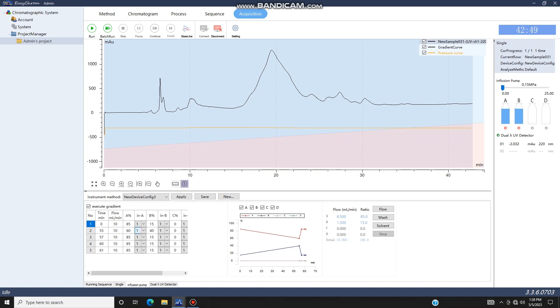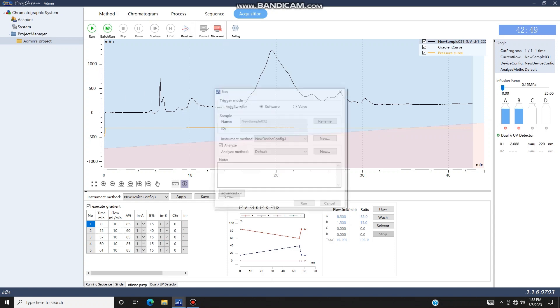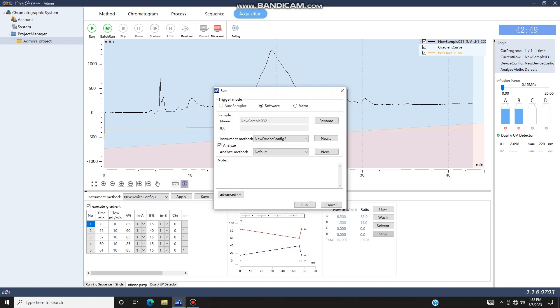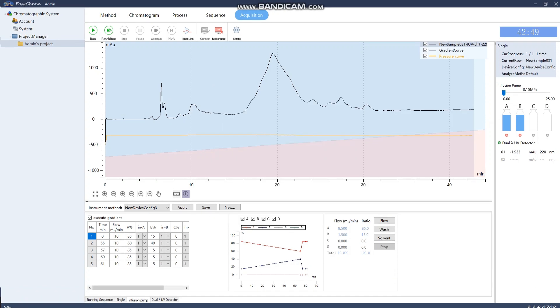Make sure your system is connected to the computer, check Execute Gradient, click Save, and select Run. You can choose to run it through the software or the valve. If you're using the software, the gradient starts after you select Run, and you will see your pumps start running. You can see Pump A begins decreasing, and Pump B starts increasing.